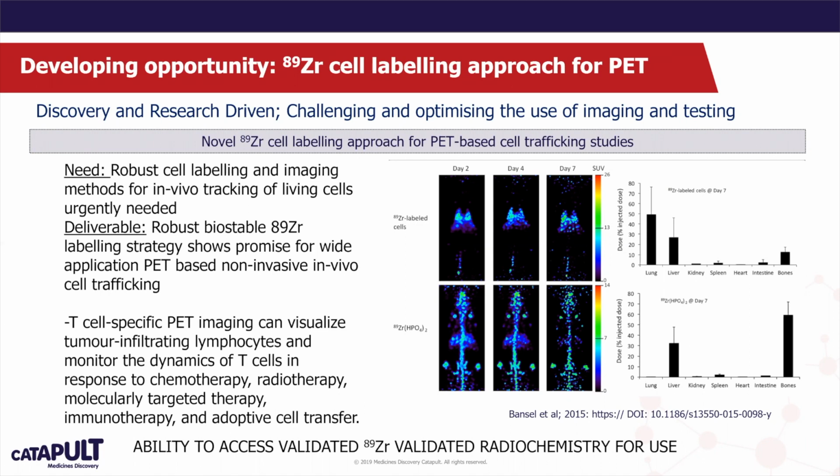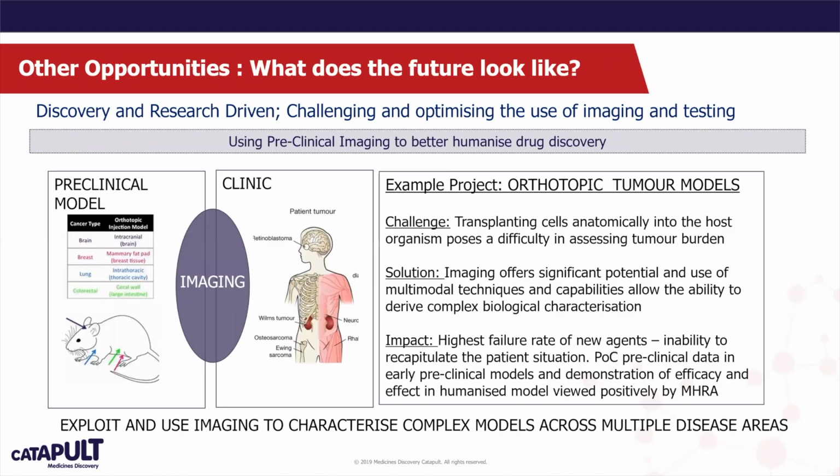So being able to identify populations of different cells within a different tissue section. So where we are seeing upregulation or downregulation of a biomarker, or seeing localization of a particular therapeutic or its metabolites, we can also correlate that, hopefully in the future, to a given cell type within the tissue to give us that much more biological relevance to what we're looking at.